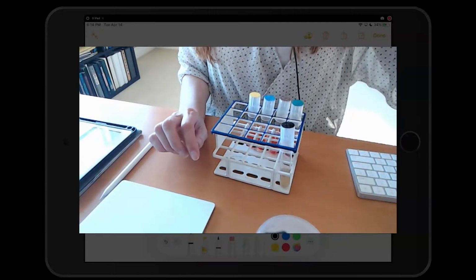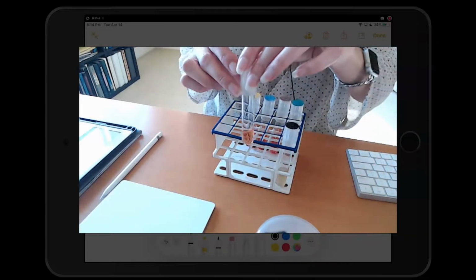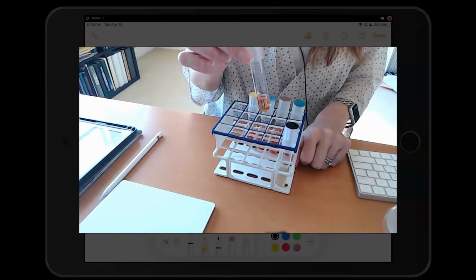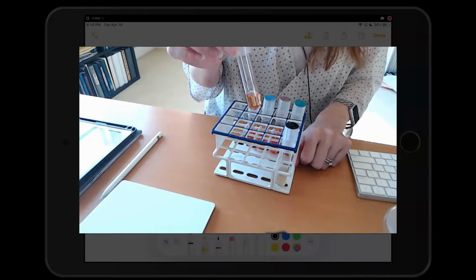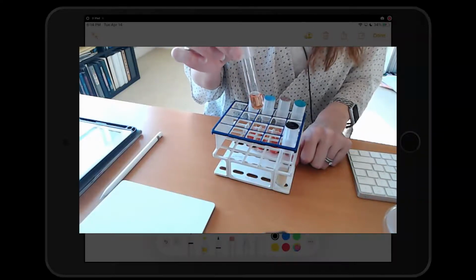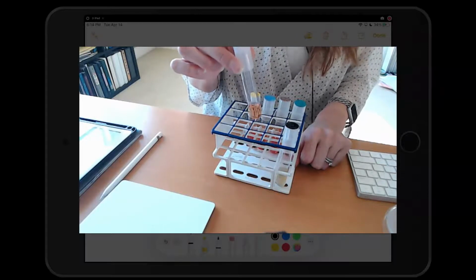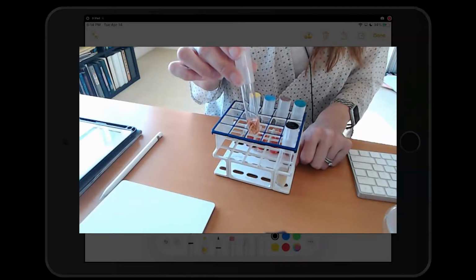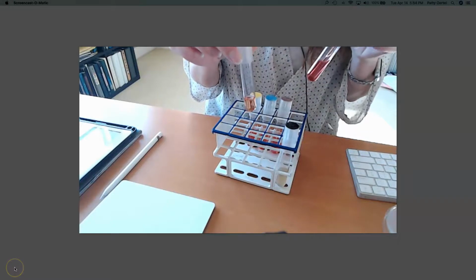Okay, so here is my culture for the urea hydrolysis. It also has this sort of red pigmentation to it, right? I wonder why. Why do you think it has that pigmentation? That's right. It also has a pH indicator. The pH indicator that's used for the urea hydrolysis test is phenol red. Ooh, just like our carbohydrates. That's right. So this media.